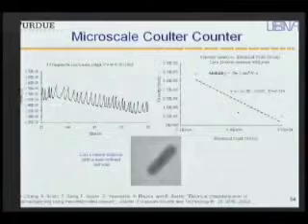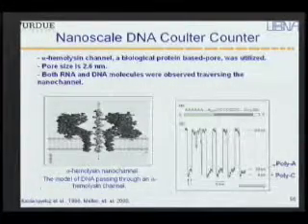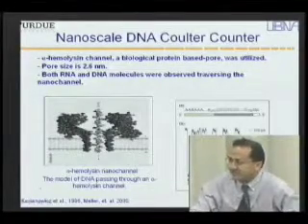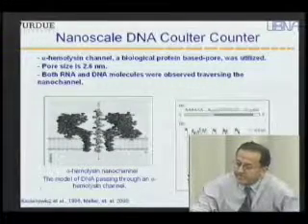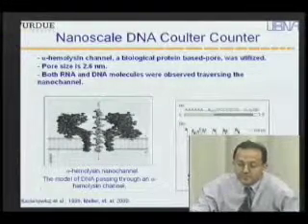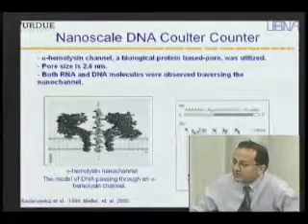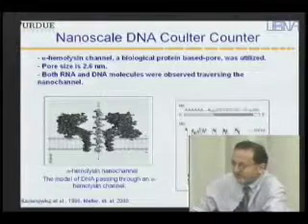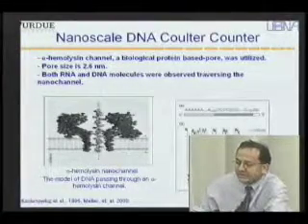One of the most exciting examples of this idea of passing single molecules through a pore has been done for DNA, and this has become a very important area of research where various groups are working on making synthetic membranes with nanoscale pores to pass DNA through them. So this concept was initially demonstrated by Kasianowicz and group using a lipid bilayer and a protein channel.